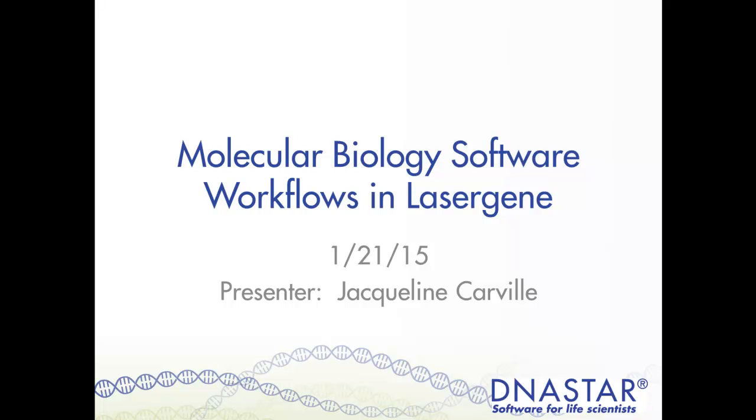My name's Jackie Carville, and to get started I'll be giving some background on the company and then going through several different molecular biology workflows found in the Lasergene package.